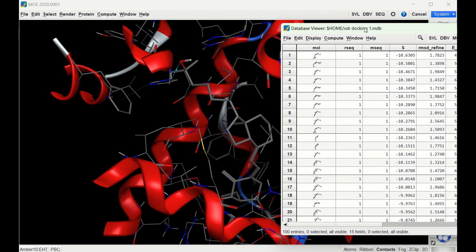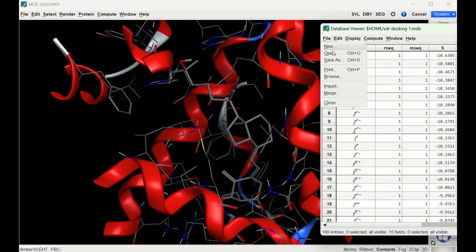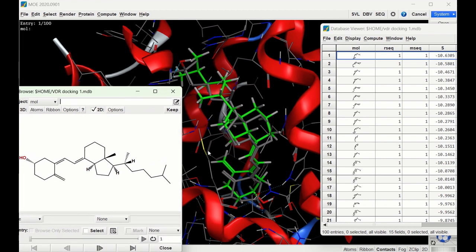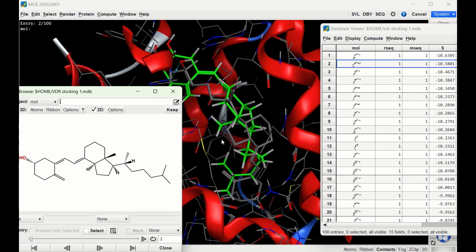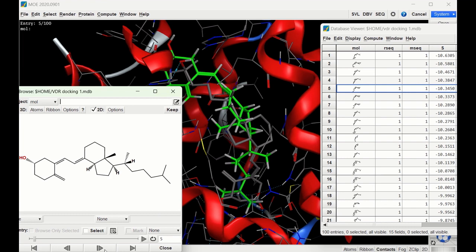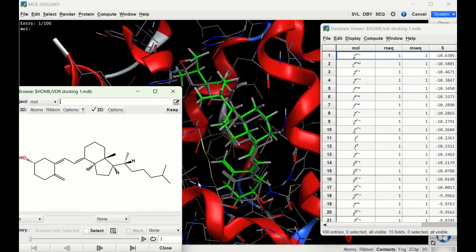Let's look at what some of these poses look like by going to File and Browse. The first pose of ligand one looks pretty good — the two rings line up relatively well with the crystallized ligand, the six-membered ring lines up fairly well, and the long chain is in relatively the same place. The second pose doesn't line up well at all — the ligand is basically flipped in the receptor. Going through the remaining poses, none look better than the first, so the first pose is likely the most accurate.